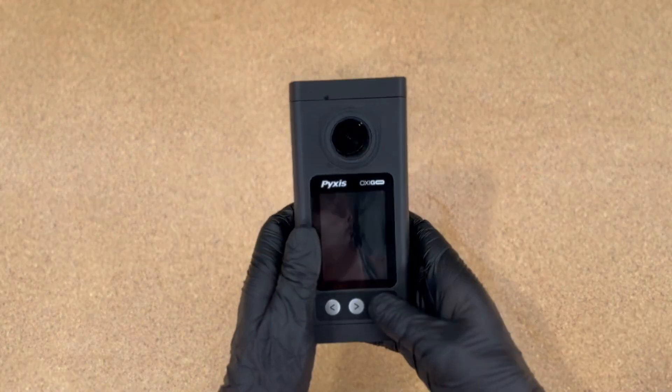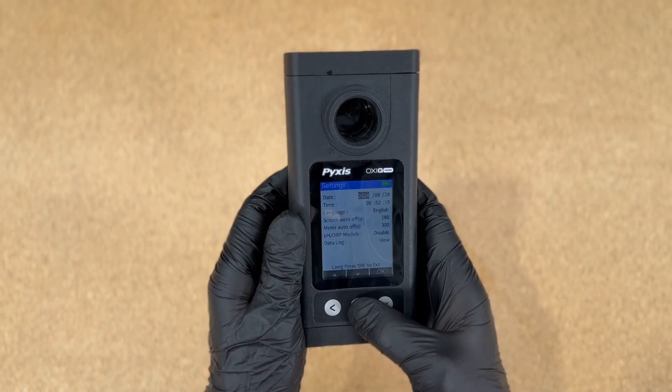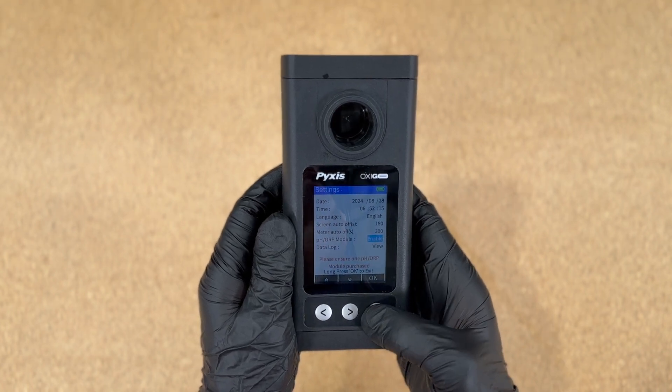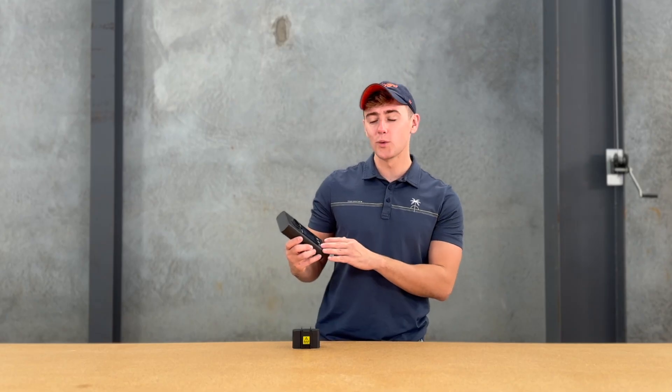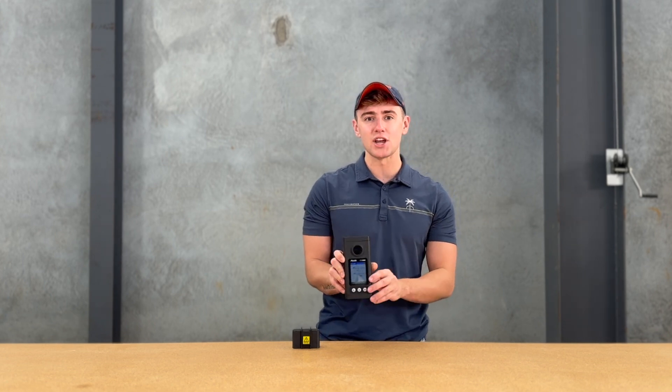On the device, you want to select System, head over to Set, and there's a new area there where you can now enable a pH ORP module. Back on the home screen, you can cycle through low range, high range, free and total chlorine, and now you can cycle over to pH and ORP.